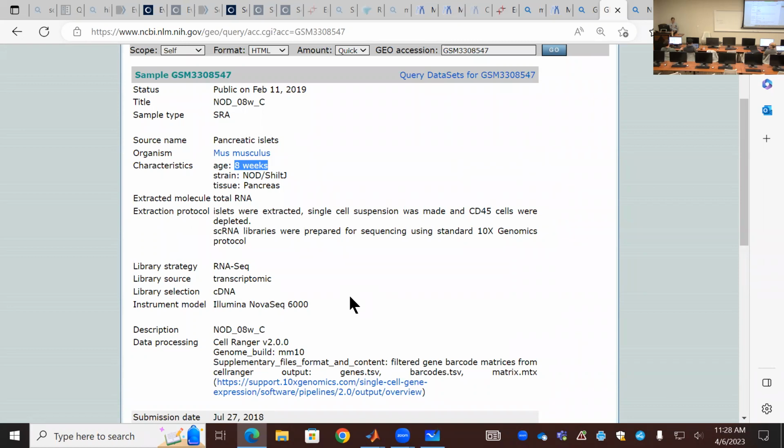Okay, we are trying to do this to compare cross sample and to detect differentially highly variable expressed gene. Okay. Right now, what we can do is just do this separately. We detect highly variable gene in week 8, highly variable gene in week 14, and see what's the difference between them. But they're supposed to have a better way to do this.